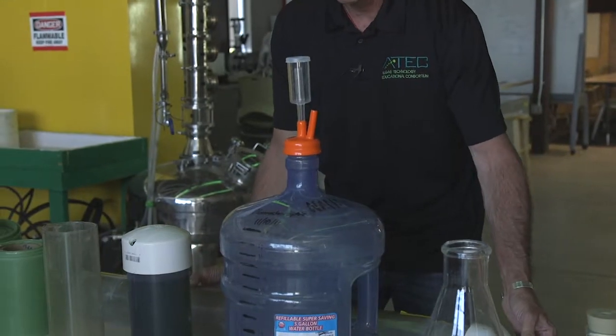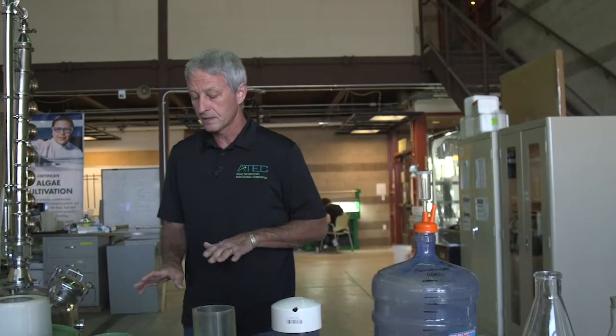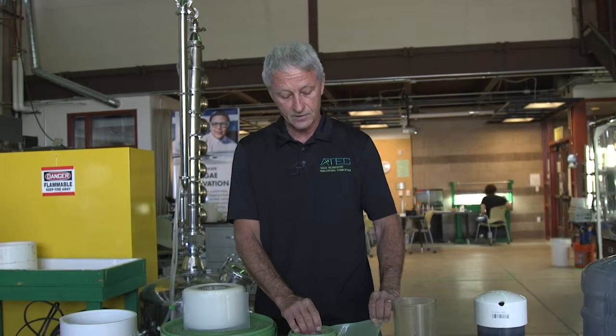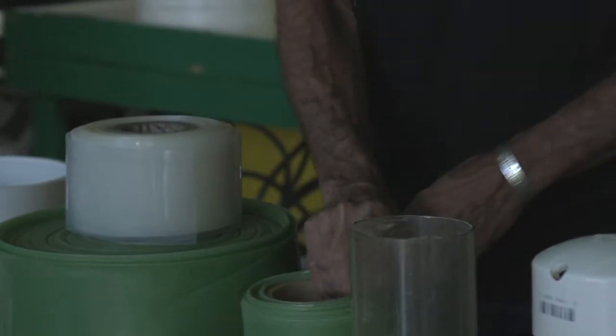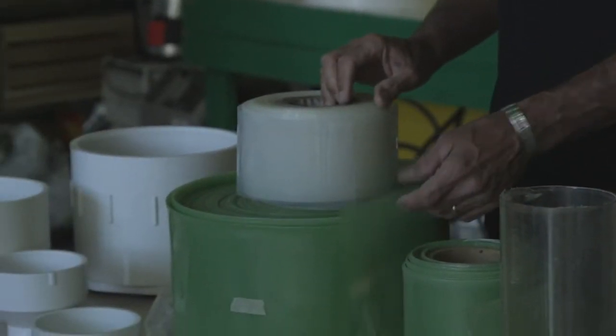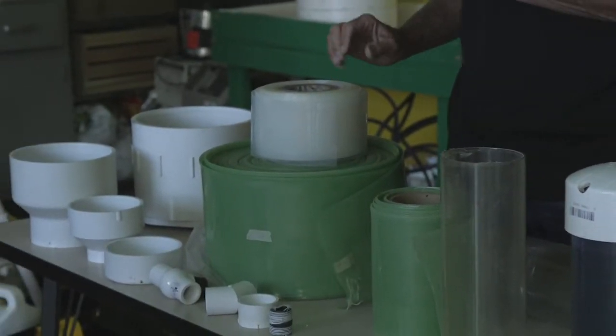This is a more traditional method. They could alternatively scale up using plastic bags — some of the industry has been quite successful with that. There's a variety of sizes and gauges. As you can see, this is an 8-inch tube here and then you have a 10-inch tube, so you can alternatively use a soft plastic rather than one of the hard plastic materials.